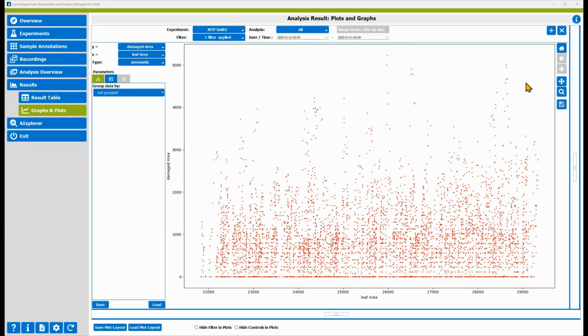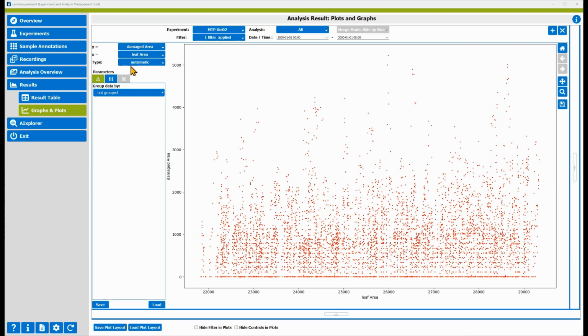You may have noticed the plot type is selected automatically by a similar heuristic. This plot type heuristic is activated if the plot type is set to automatic. There are other plot types available: line plot, scatter plot, bar plot, box plot, heat map, violin, and pies.